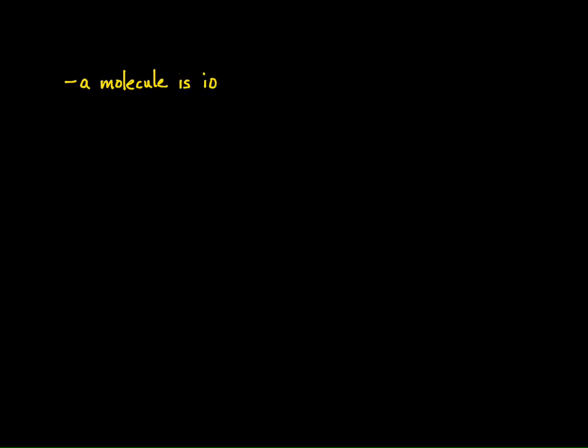So just a brief idea about what is happening in that mass spectrometer: when you bombard a molecule with high voltage electrons, you create what's called a radical cation. I take my molecule, bombard it with high voltage electrons, and they essentially kick off an electron because of electron-electron repulsions. The result is that now I have a radical, because one of the electrons has been discharged, and the molecule has a charge of +1.